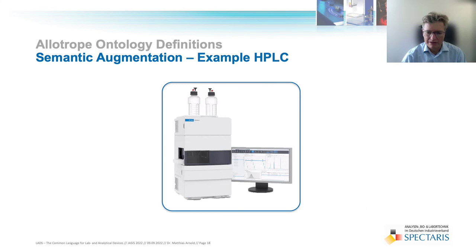In the following example, I will demonstrate how to associate LADS OPC UA information model items of an integrated HPLC system with corresponding semantic definitions in the Allotrope Foundation ontology. As a first step, let us look up some matching definitions in the Allotrope ontology.